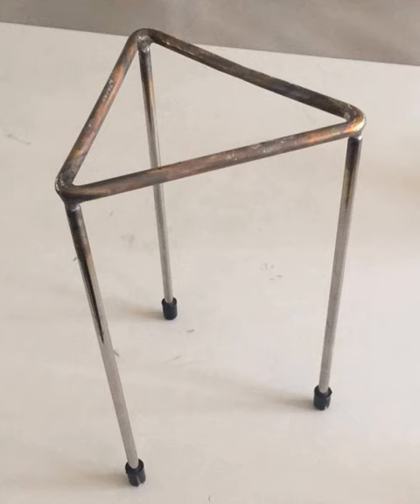A laboratory tripod is a portable, three-legged platform equipment, which is usually made of lightweight metal such as stainless steel and aluminium so that it can be moved conveniently within the lab. The main usage is to support or hold the flasks and beakers during experiments. Most of the time a wire gauze is required to be placed on top of the tripod in order to allow the glasswares to be placed on top of it. Due to its height, a Bunsen burner can be placed underneath to heat them up.